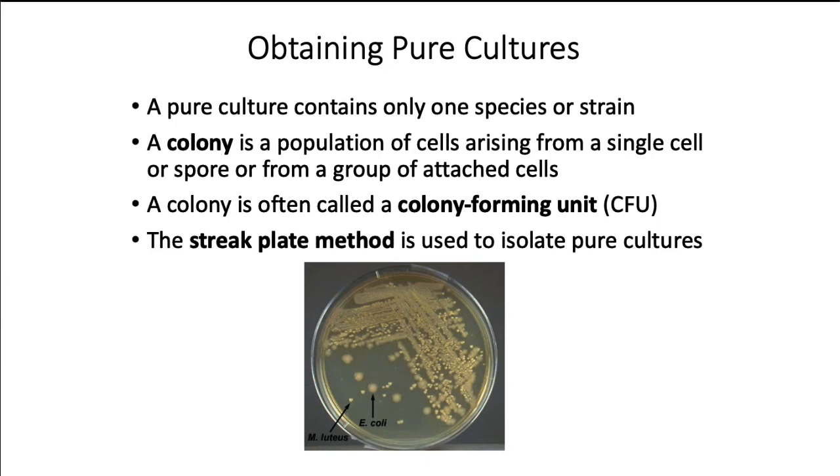And in the simulations, you do streak plates, and what it entails is that you dilute your sample on the plate. You keep spreading your suspension on the plate, so by the 3rd or 4th, sometimes the 5th streak on the plate, the sample has been diluted enough, so the colonies are going to be distinct.